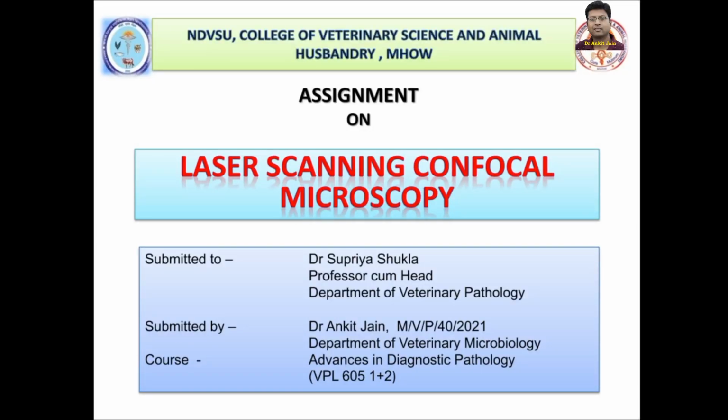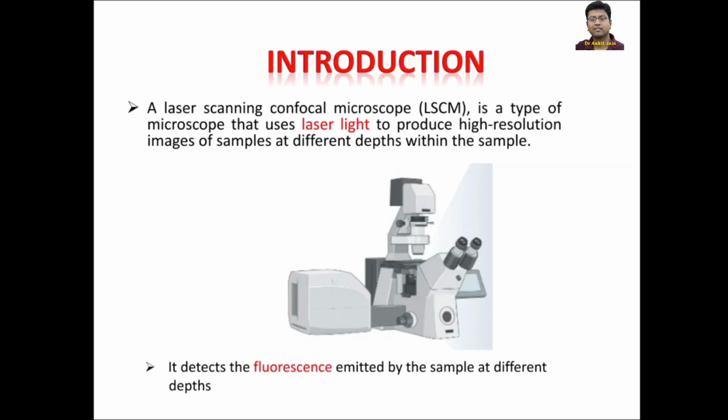Hello friends, today I am going to discuss a new topic, and the topic is laser scanning confocal microscopy. As the name suggests, it has a laser beam which scans the sample, and finally we get the image with the help of a camera.